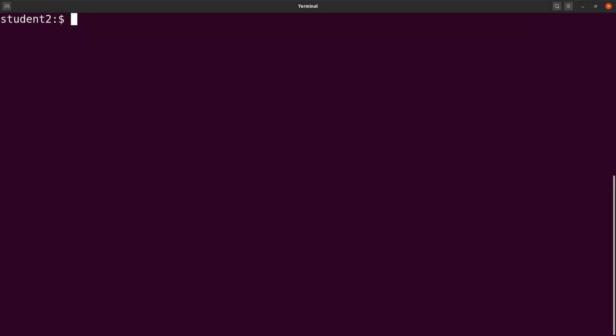On the terminal, we can also download it. So to download on the terminal, which I'm going to do, I need to first get a link. So just copy this link here that I am hovering my cursor over, and then use that. So let's go to the terminal, and then I'll show you what to do. On the terminal, let's first create a directory where we will work in. So we say mkdir RNASeq, and then let's cd to it.